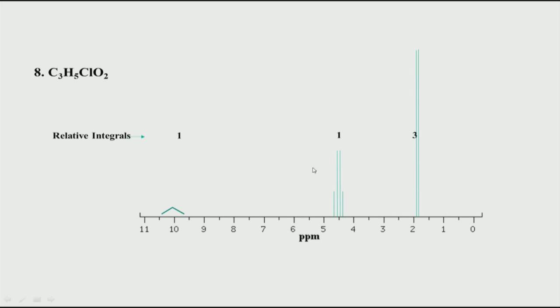So, let us now look at this example. Again here we have a carboxylic acid group, that is why a single proton is coming very much downfield shifted. Now, instead of two triplets as we saw, there is a quartet and a doublet. Again remember this is CH3. It means it is a methyl group that seems to be coupled to one hydrogen, because only then you get a doublet.